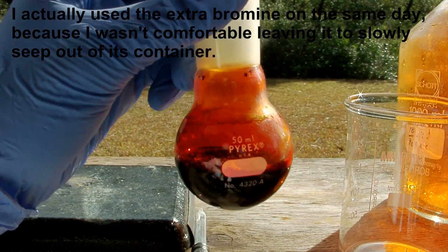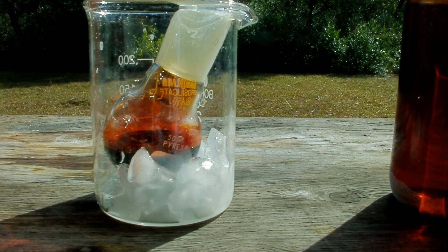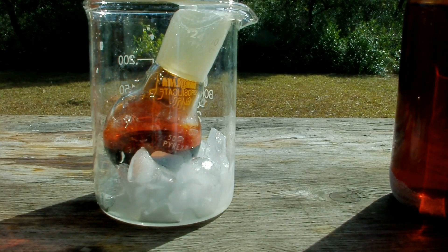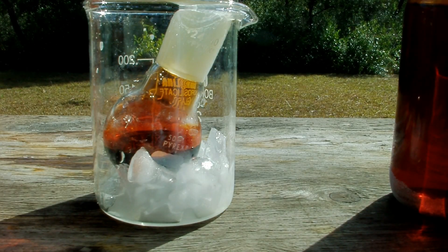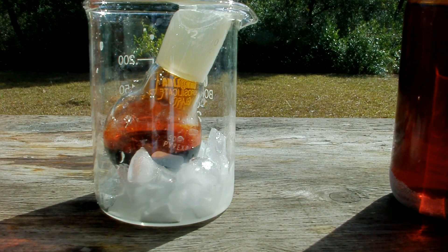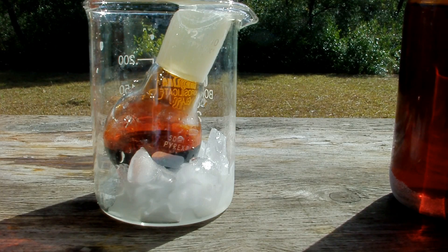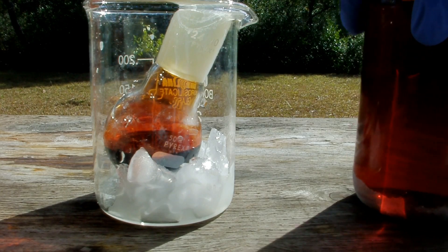I've waited a long time to get bromine — I'm very excited to have it. Now that I've got my elemental bromine, I want to dry it before I ampule it. Drying is necessary because there's still a little bit of water dissolved in this bromine, and that's going to cause it to stick to the sides of the glass. I don't want that for a nice element sample, and it's also good to be dry if you're going to use it for any experiments.